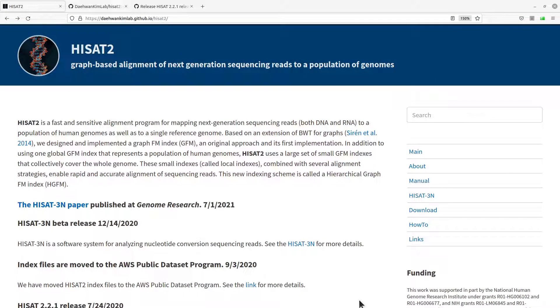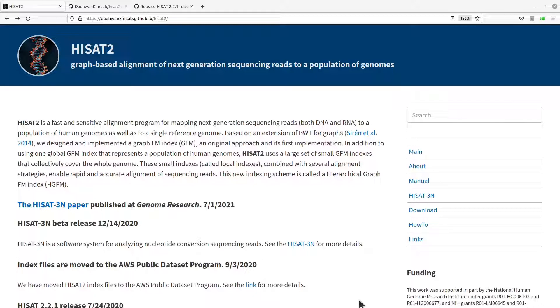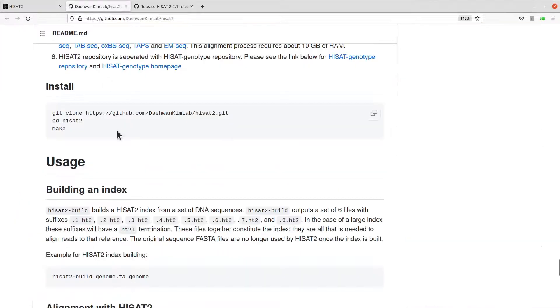At the time of making this tutorial, what worked for me was GCC 9.3, so just use the version that works best for you. Let's proceed. Let's go to the GitHub page and then look at how to install HISAT2 by building from source.